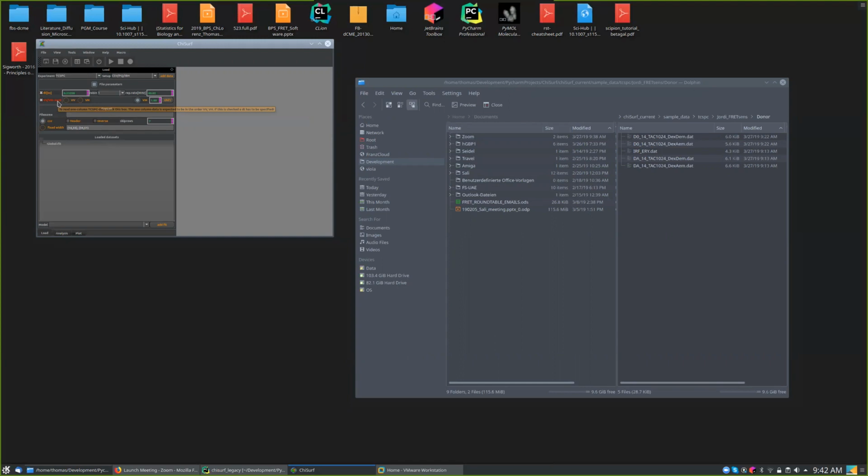One more question regarding the G factor here. Should I type it there or not? Yeah, exactly. This was what I was talking about now. You have three options in principle when you load in these Geordie files: VV, VH, or VM. And VM is actually not vertical magic angle detection. VM here is just VV plus 2 times G times VH. Okay, this number here is then the G factor. I think it should show here. No, it doesn't show. This is the G factor here. Okay, it should be 0.98. So it's close to one, probably wouldn't make a difference. Yeah, it is.